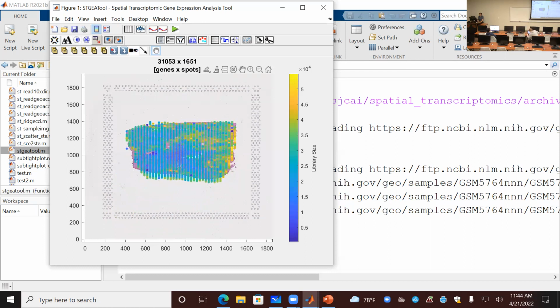Okay. I just assume this is correct. But I guarantee it's not so hard for most of the samples, not like this. We can make it smaller so it fits perfectly and zoom along the x-axis, whatever. So at the end, you will achieve something like this, okay?